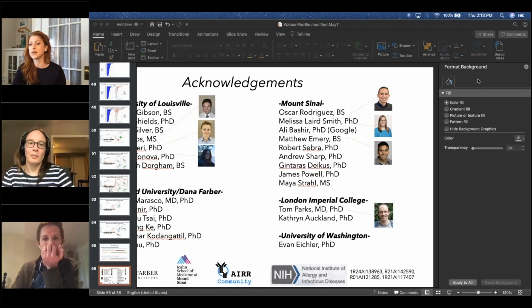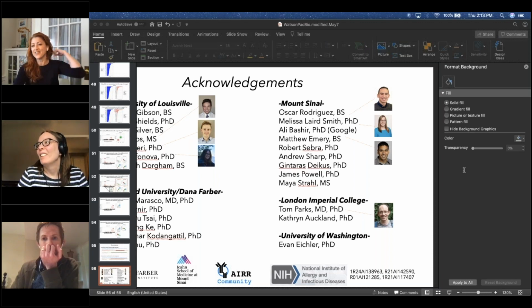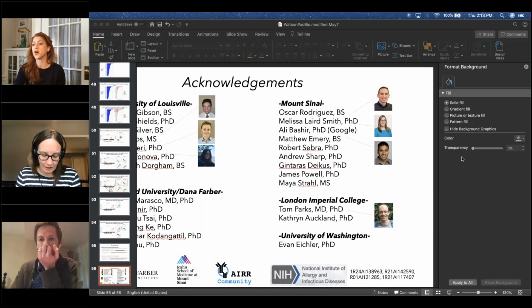So the first one is from Ellen Paxinos. Hi, Ellen. She asks, how well do the different versions of the SARS-CoV-2 amplicon sets work on patient samples? Will you do primer balancing and reaction optimization on real samples or using the synthetic control?